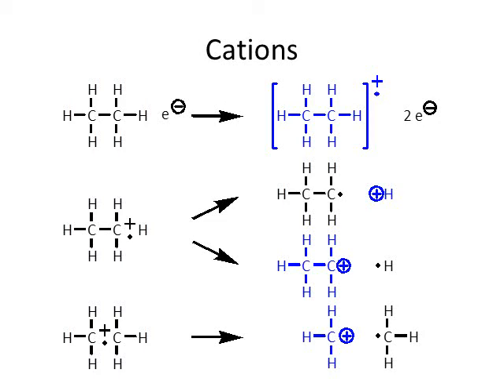The positively charged species. It turns out in this example, after this is excited and starts to fall apart, within that large number of molecules, say 6.02 times 10 to the 23rd, well, there wouldn't be a mole, but still 6.02 times 10 to the 20th, because you just squirt a little tiny amount into the ionization chamber.